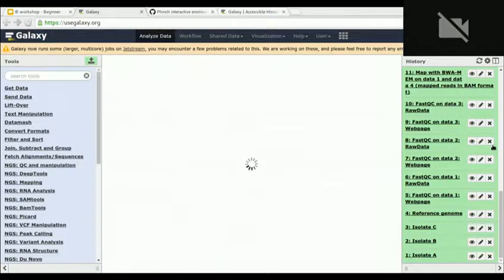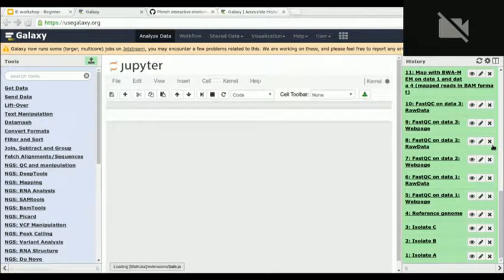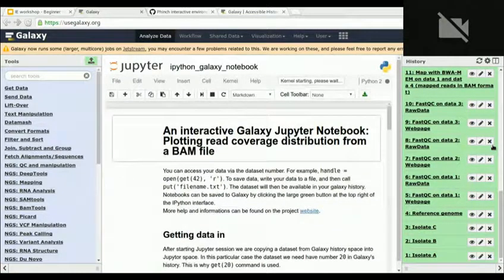Just like Björn was saying, we did all the heavy lifting here in the sense that we mapped them, which made a single BAM file. It's just one BAM file because we reprocessed today just to bundle everything in a single file. And then they decided to develop a kind of Jupyter example from that.